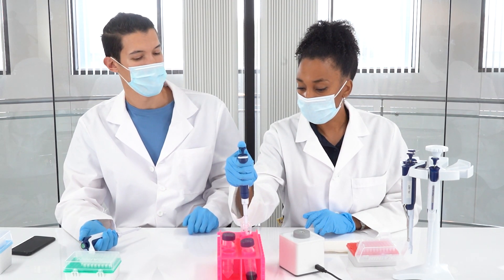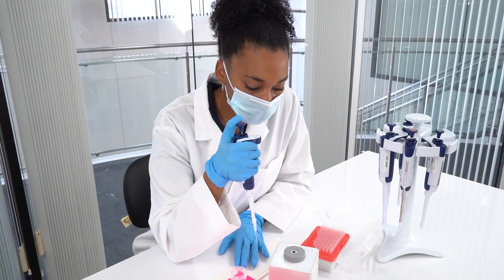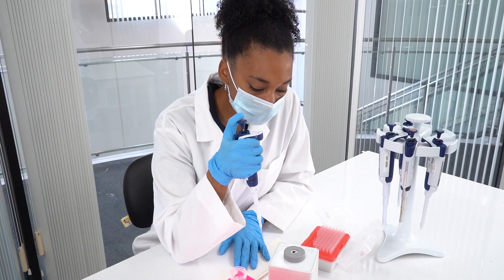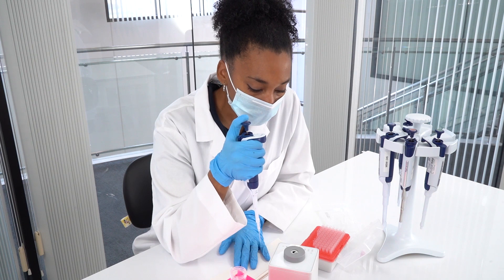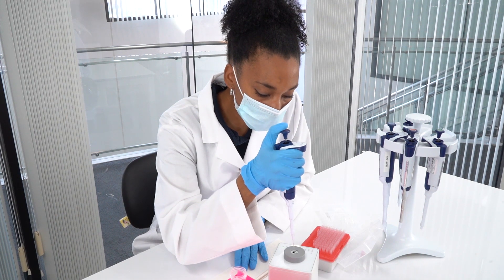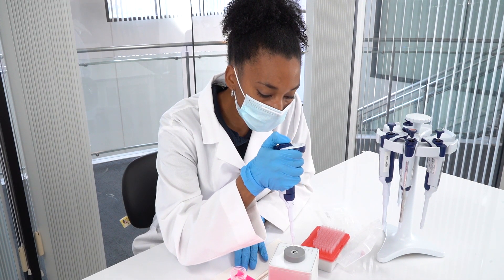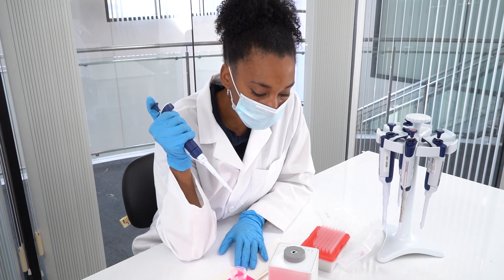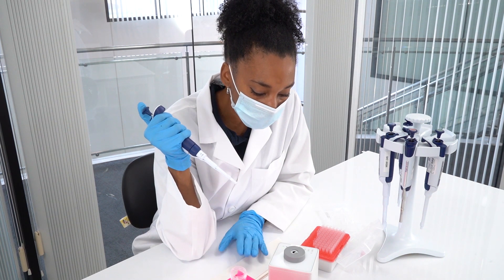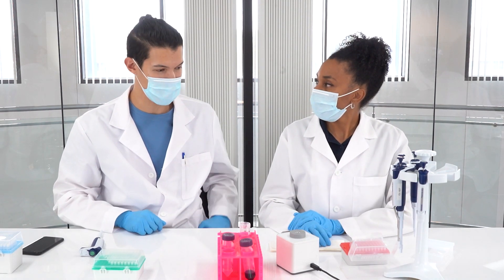Your technique looks great to me. Yeah, I think my technique is pretty good, but what I've learned from Smart Check is that I cannot pipette less than 50 microliters using a 200 microliter pipette. So my company purchased a 20 microliter pipette, and now I'm in range every time.